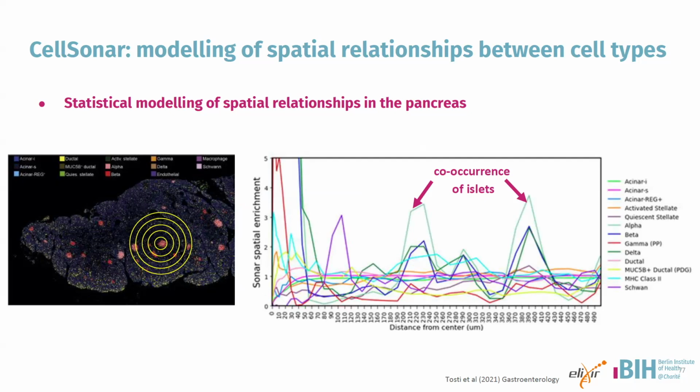And those cells are actually located in these kind of red bodies. And if you look at them, you can practically make out small triangles. So the distribution of these cell types within the tissue themselves is at a fixed distance. So we can still use these types of maps to identify spatial relationships that are quite apparent.